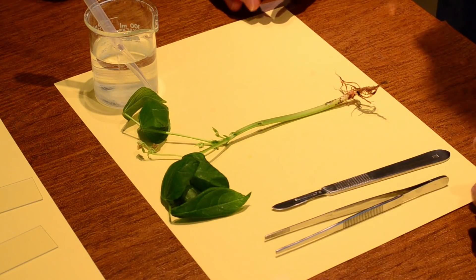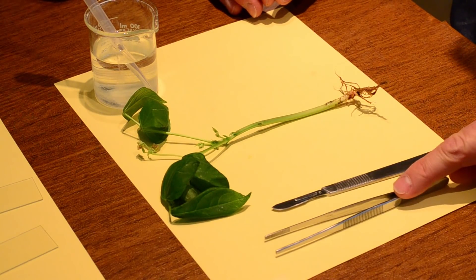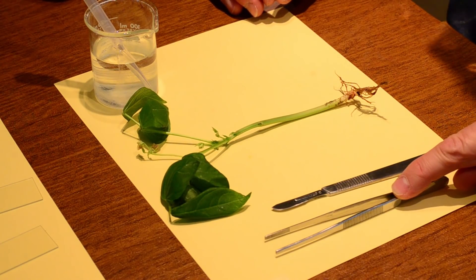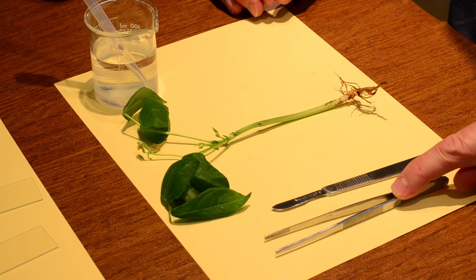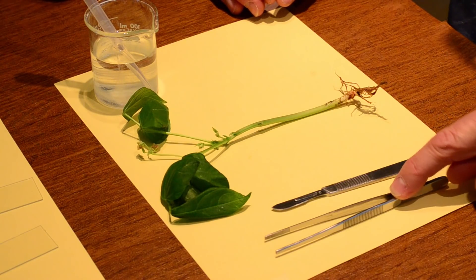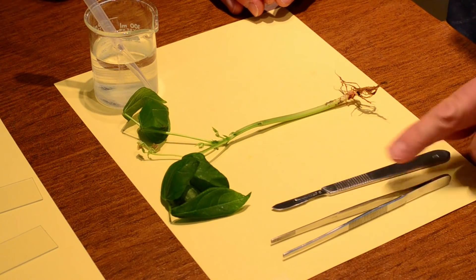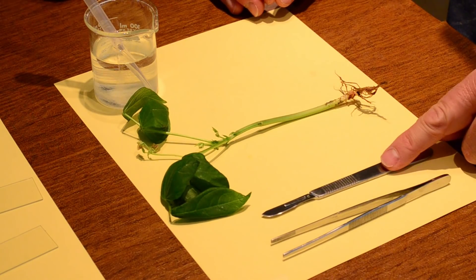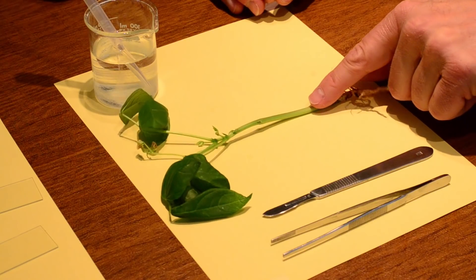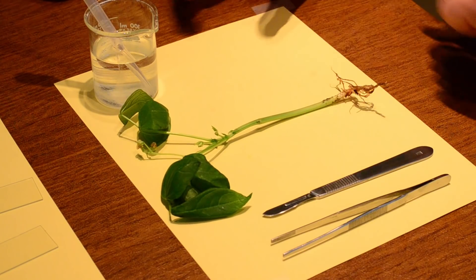Alright, here's the tools that we're going to have. We're going to have some forceps to hold the plant. So we do not have a scalpel in hand and our fingers on the plant. We're going to be using the tools. So we've got our forceps, our sharp scalpel that we're going to be very careful with, our plant, and a water dropper.